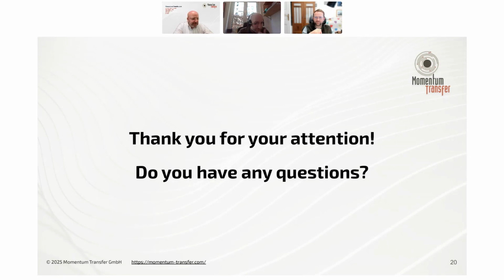Okay. Then I think we had a couple more questions. Going back to the sample preparation, are there any sieves you recommend with micron-sized meshes, ideally without a large diameter, for dealing with smaller volumes of sample? That is a very good question, and I have to say, no, I don't.